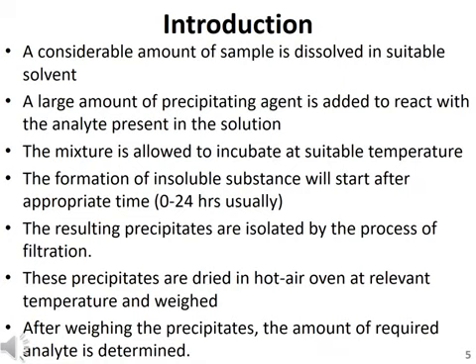These solid particles will be known as precipitates. When the precipitating agent and the solution react together, the reaction is allowed to incubate at a suitable, required temperature, which is a prerequisite for the completion of the gravimetric analysis.